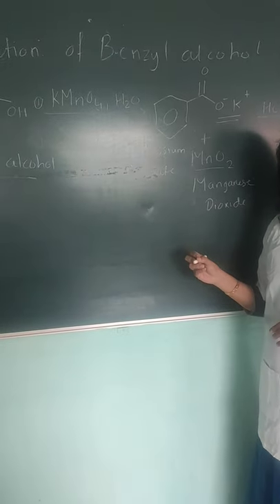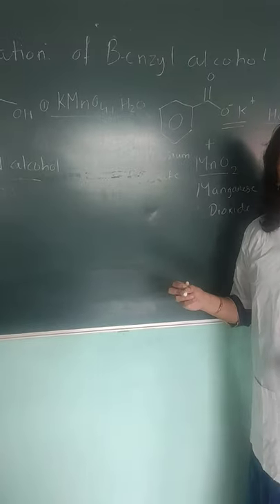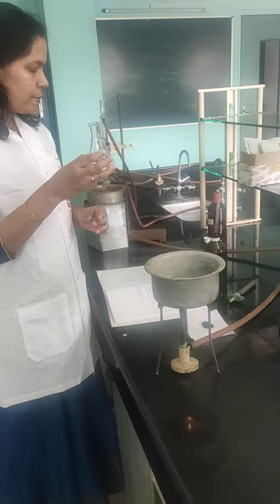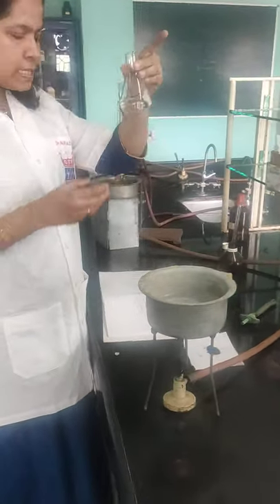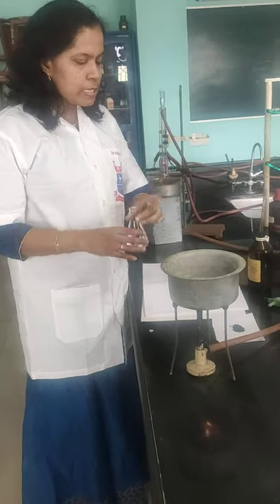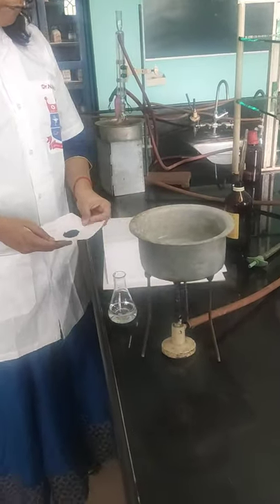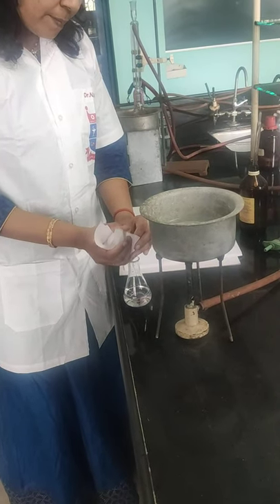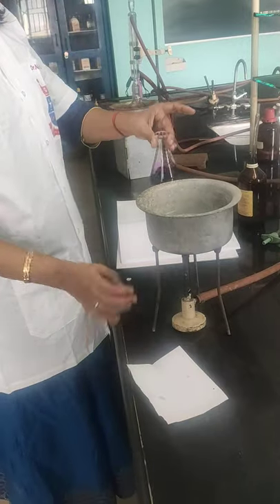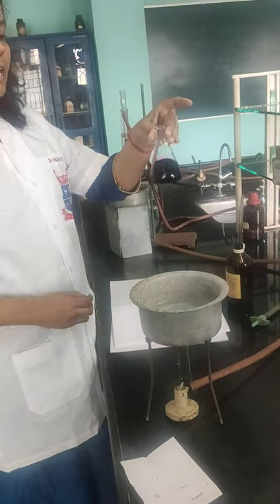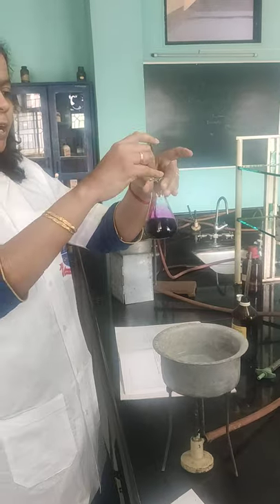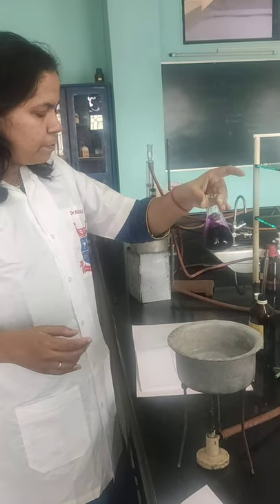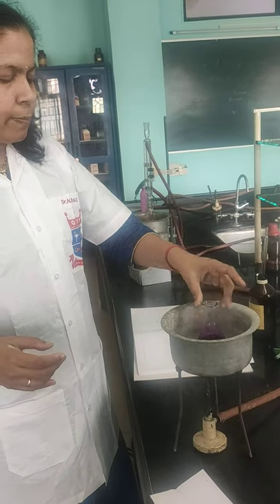So we will look at the reaction now — how to perform it. As per the procedure, I have taken 60 ml of water. To this, I am going to add a pre-weighed quantity of potassium permanganate, that is 3 grams. Just to prevent bumping and ensure uniform heating, I am going to add a porcelain piece to this conical flask and place it into a boiling water bath.